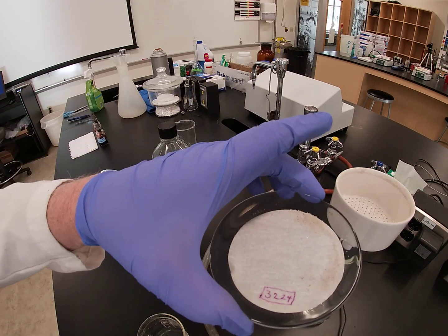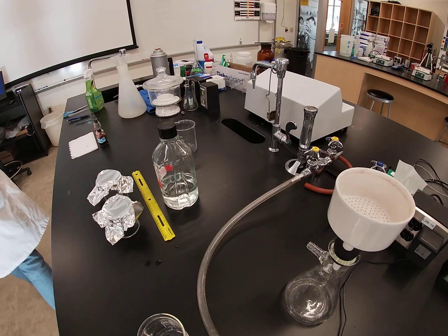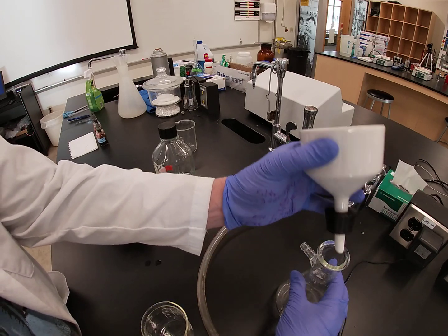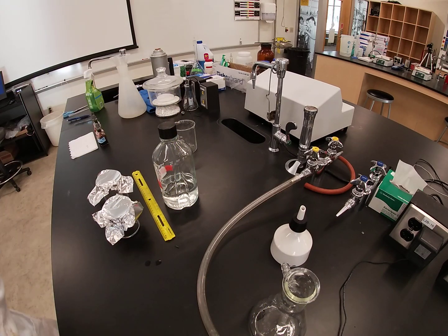So this is the watch glass setup with the filter paper on it. I'm going to put that in our drying oven. We're going to dry that and then take a mass of it once it's dry. So what we're going to do with our liquid, we're going to pour that back into our beaker. We'll set it over here on a hot plate and turn it up, and we're going to do the process of evaporation.